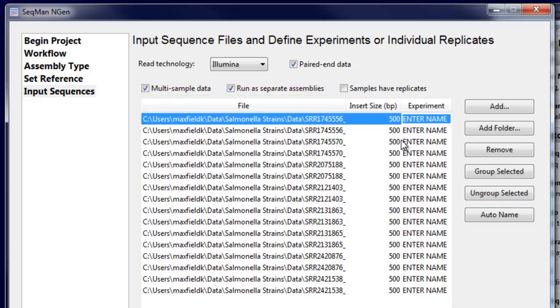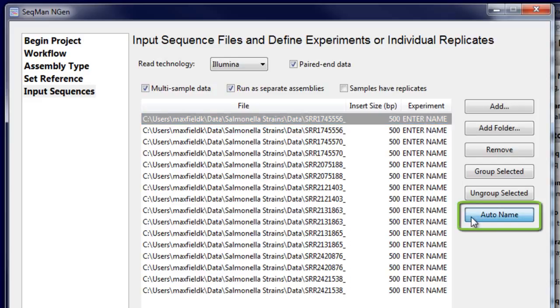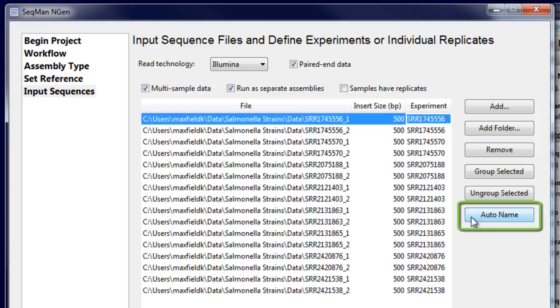Then, name your experiments either by typing in a name, or using the Auto Name button to create names based on the file name.